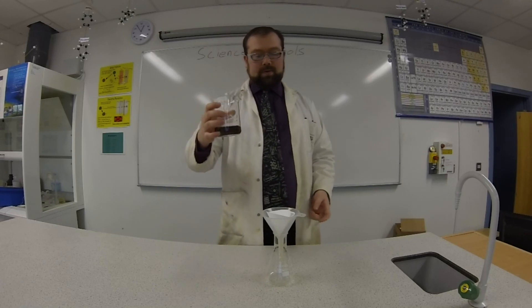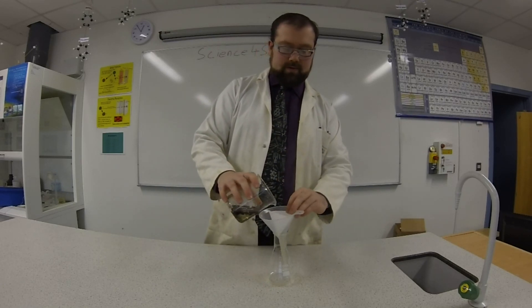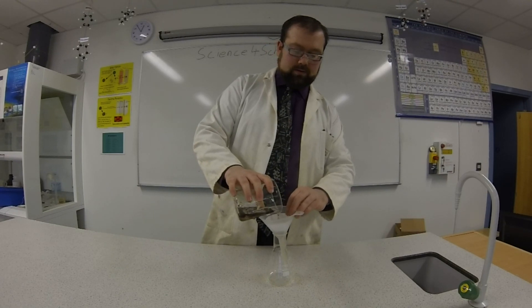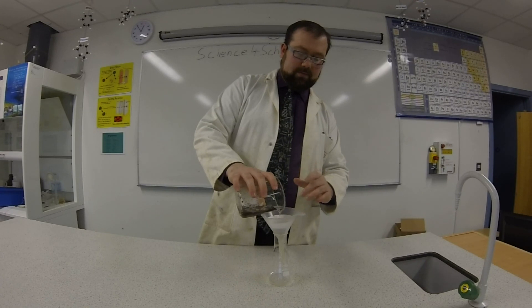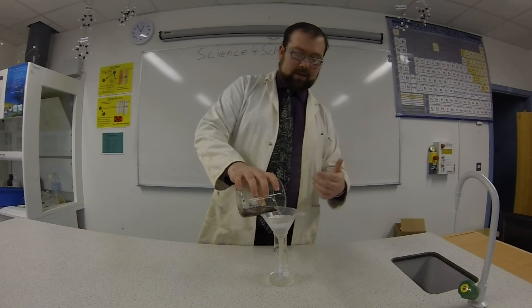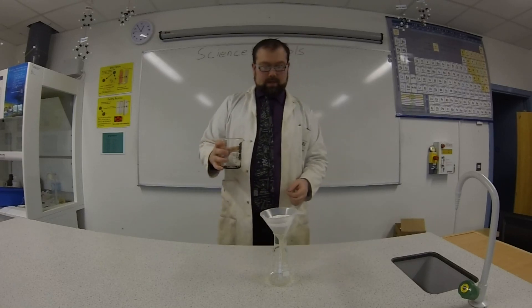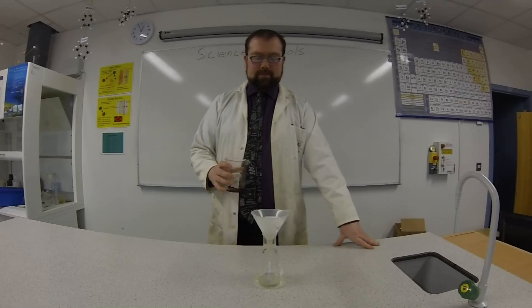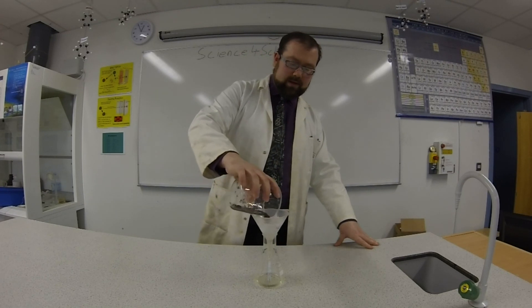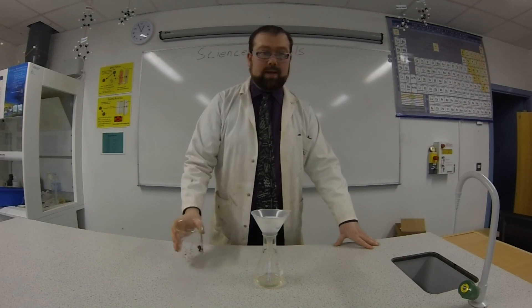Now, there's not much to this — all we've got to do is pour this through the funnel, just make sure it all goes through the filter paper. Make sure none of it rises above the level of the filter paper as well, otherwise it could just sort of slip down the edge. Let some of that filter through and then we can get some more in. Just going to pour the last of it in now — get a load of dirt and grime in there so we can see what ends up in the filter paper at the end.